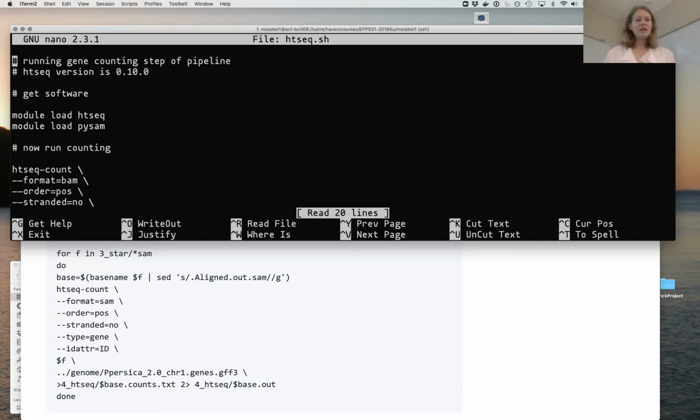is, okay, I think there's a command in Nano to delete a whole line. Does anybody remember what that command is? Is it Control K? Thank you. Perfect. So I'm just going to delete all of that and get myself a fresh start.